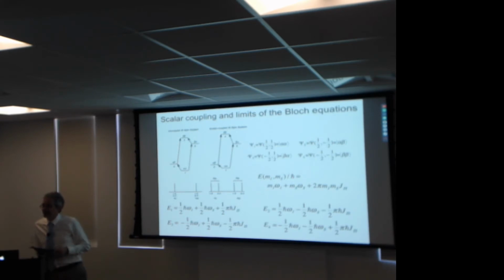And in fact, you've already seen that. I happily said that we could measure the X magnetization and the Y magnetization and treat them as a complex vector and Fourier transform them. But remember, quantum mechanics said I couldn't specify the X and Y components of the angular momentum operator at the same time as the Z component.